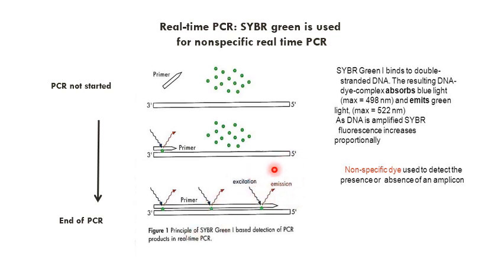So the emission signals will be reported to measure the quantity of the DNA. The more you extend the DNA strand, the more signal you will have, and then you will know the amount of your DNA.